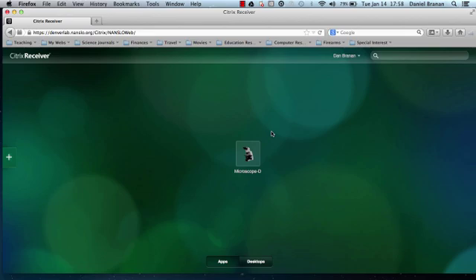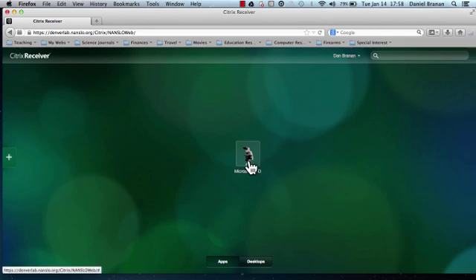This tutorial will show you how to use the control panel for the Nanslo remote microscope. When you log into the remote lab, you'll see a screen with an icon on it for a microscope. Click it to start the program.